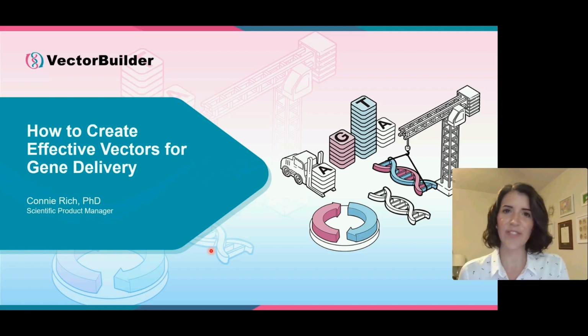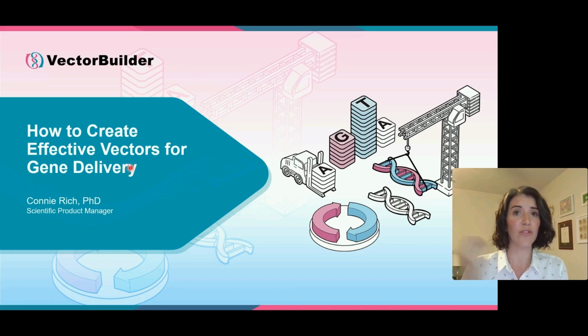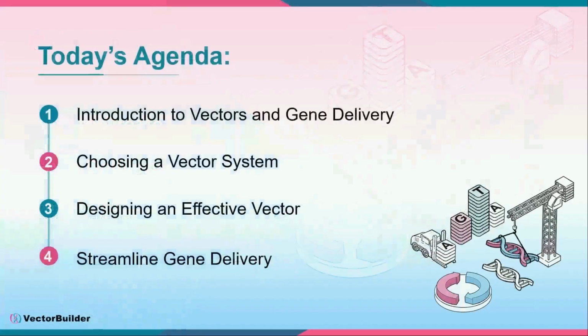All right, thank you for the introduction. Hi, everyone, welcome, and thank you for joining us to talk all things vectors as we discuss how to create effective vectors, both choosing and designing them for gene delivery. Now today, I'm looking at this as kind of more of a gentle dive into vectors and gene delivery.